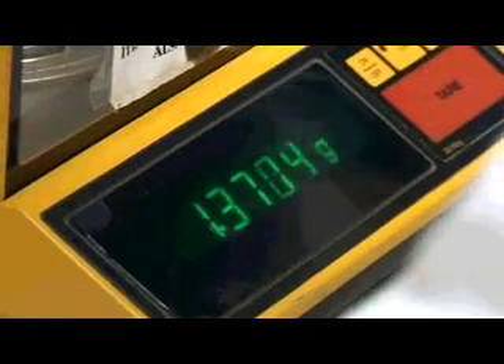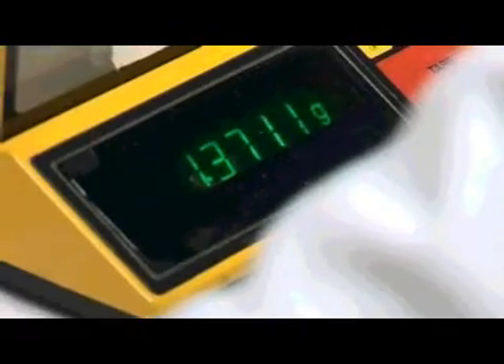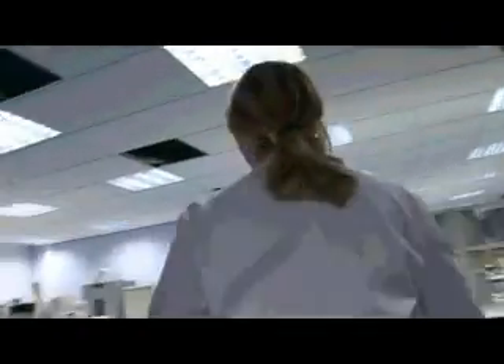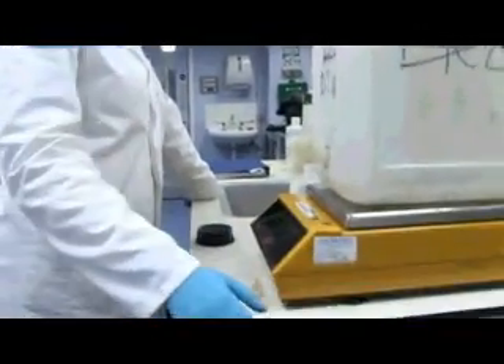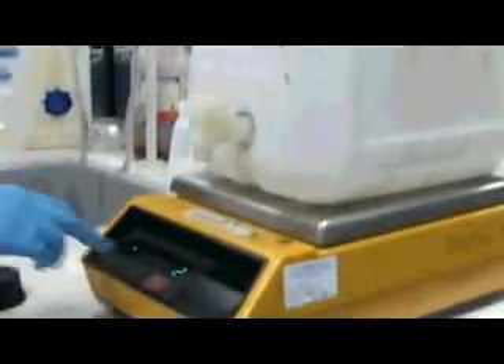What are you aiming for? 1.371, as close as possible. Deionized water is equal to one gram, so to make up this solution I need this amount in 20 litres to get the right concentration. So if I put this in, zero it, and then weigh out 20 kilograms.